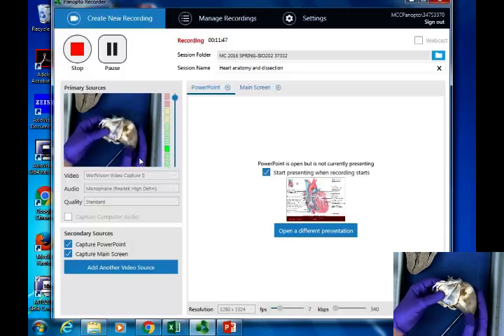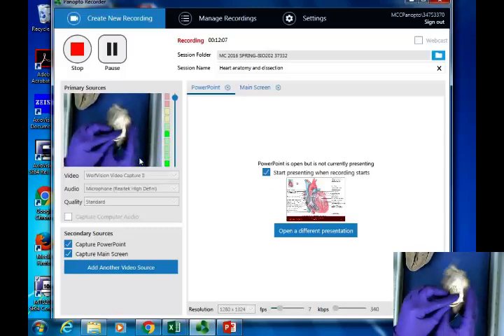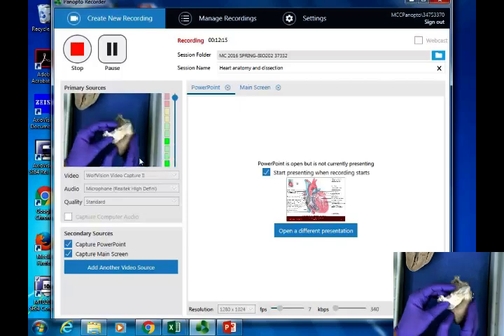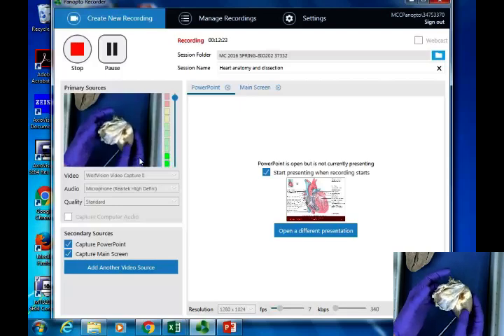Okay? Now, in terms of membranes, remember, if we point to the surface of the heart and we say name the membrane, we would call it the visceral pericardium. Visceral means guts. So it's going to be right on the surface of the organ. If we were to point to the inside of the bag, in here, and say name the membrane, that's where the parietal pericardium is going to be located. That way, when the heart's in its bag and it's moving around, it's not generating any friction. We've got two serous slippery membranes that are going against each other that allows it to move very easily. So serous membranes, both of them, parietal pericardium here, visceral pericardium over there.